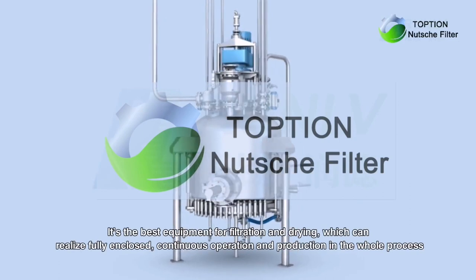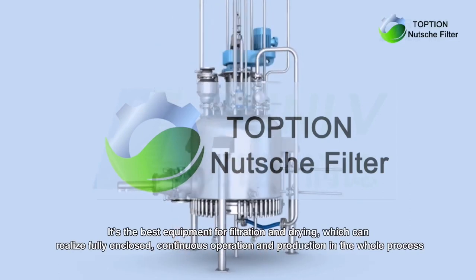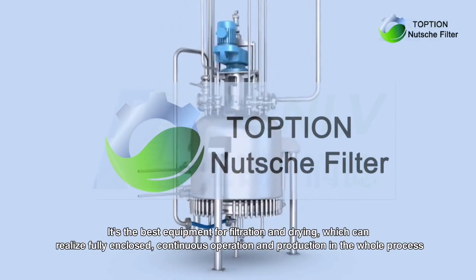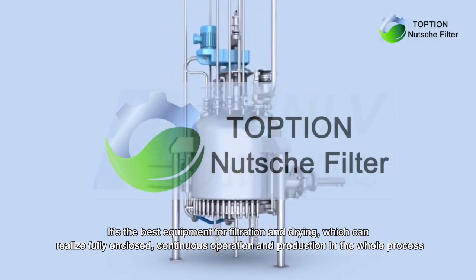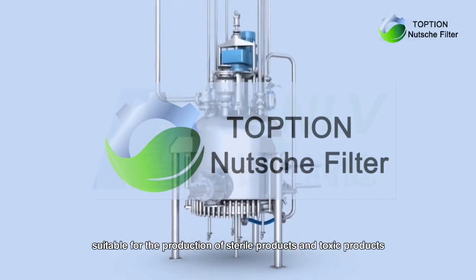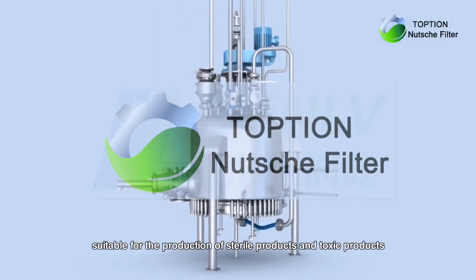It is the best equipment for filtration and drying, which can realize fully enclosed, continuous operation and production in the whole process, suitable for the production of sterile products and toxic products.